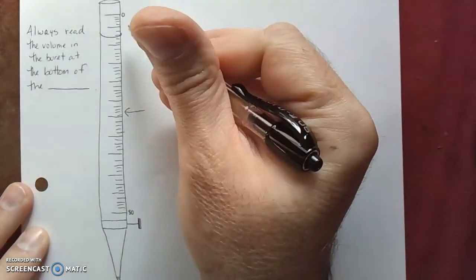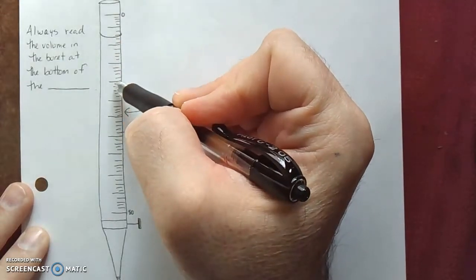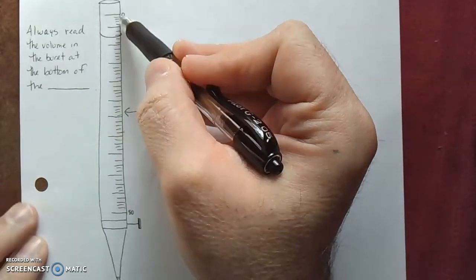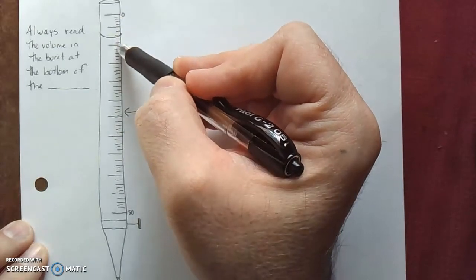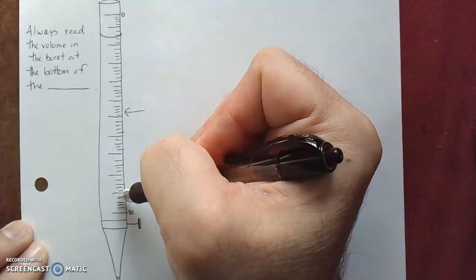This starts up here at 0 and goes down to 50 milliliters. So it is a reverse scale. So if this were 50 up here and you drained it down to 10 or drained it down to 40, you'd have to subtract it to get your amount. By having this as a reverse scale, you know that if it drains down to 10, 0 to 10 is 10. So it's able to be read.